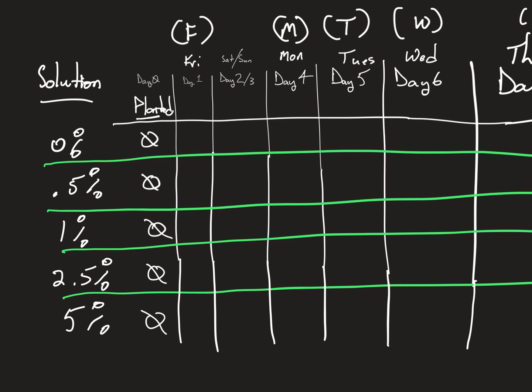Now, tomorrow, are there going to be seedlings? I don't know. We'll see. Honestly, I don't expect any tomorrow. Saturday, Sunday, we won't know because I'm not coming in on Saturday, Sunday. I don't know if any of you are coming in, but I'm not. I'm going to put water in the tray, and it'll keep it watered throughout the weekend. So we're not going to collect data on these days, unfortunately, because I just can't come in. I have too much to do at home. If I have to, I will, but it really is too much.